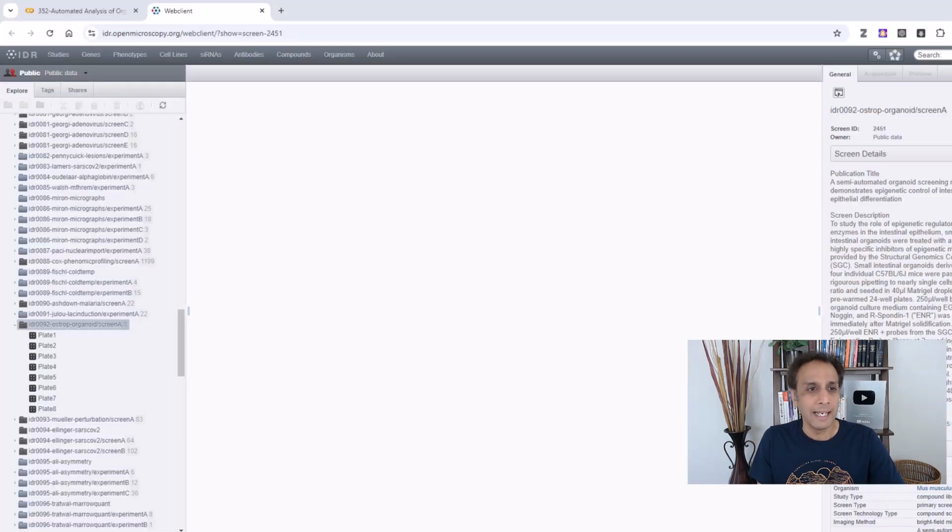Okay, enough of the statistic stuff. Now let's jump into the reason why you tuned into this video, probably to get to look at the code and my walkthrough of the code. So let's jump into the code now. And by the way, before jumping into the code itself, let's have a quick look at the data set.